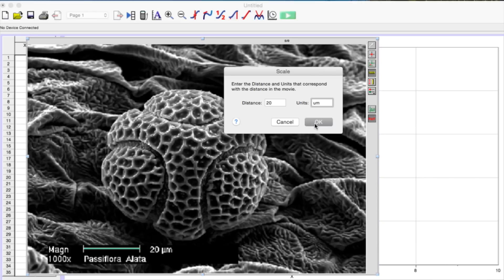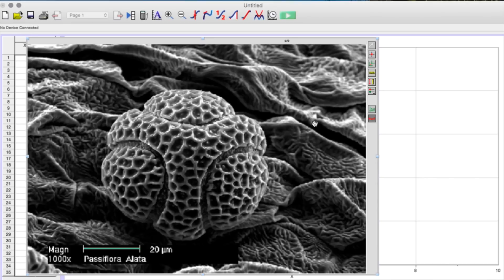Press OK. Now Logger Pro is able to immediately tell you the length between any two points on the image. For example, if I select the photo distance icon — the ruler with the red arrow next to it — and then drag the cursor across the diameter of the grain of pollen, Logger Pro will tell me the diameter.